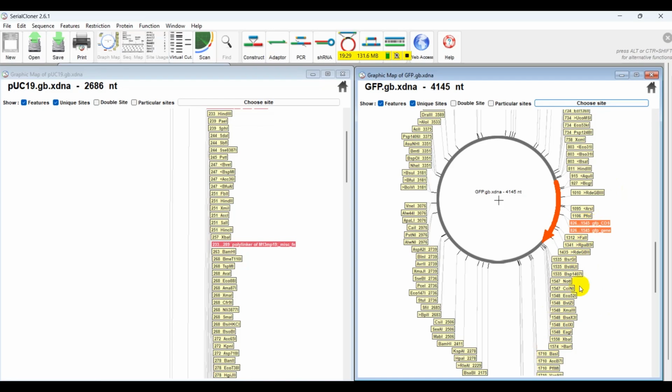1545 পর্যন্ত ছিল, তো আমাদেরকে এক্সট্রা কিছু নিউক্লিওটাইড সিকোয়েন্স সহ যে সিকোয়েন্সটাতে কাটিং সাইট রয়েছে সেটা সিলেক্ট করতে হবে, কারণ অনেক সময় কাটিং সাইটের ইন্টিগ্রিটি বজায় রাখার জন্য একটু বেশি নিউক্লিওটাইড সিলেক্ট করা লাগে, এটা আমাদের অনুমানের ক্ষেত্রে হেল্পফুল। সো for maintaining the integrity of the cut, we can select the XbaI, and you can also select this. I mean, then you need to compare this cutting site with here.